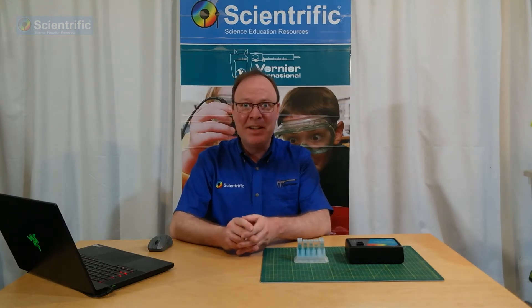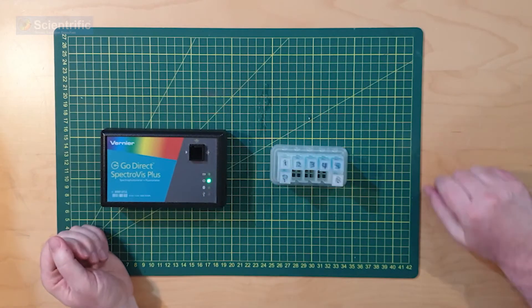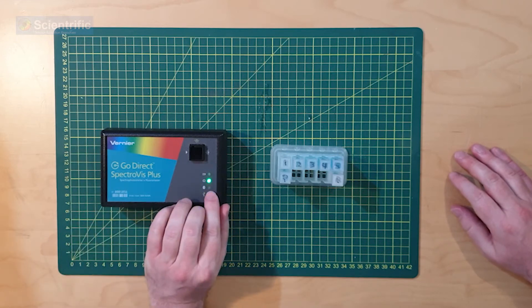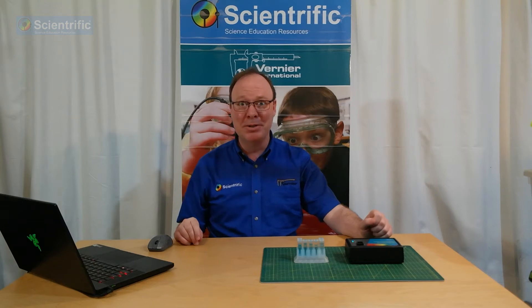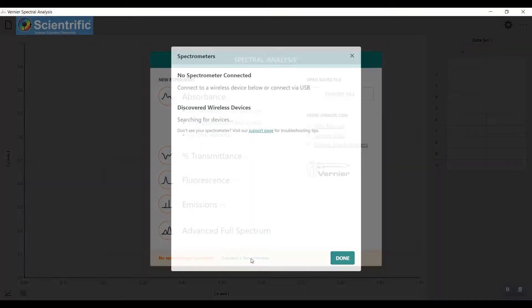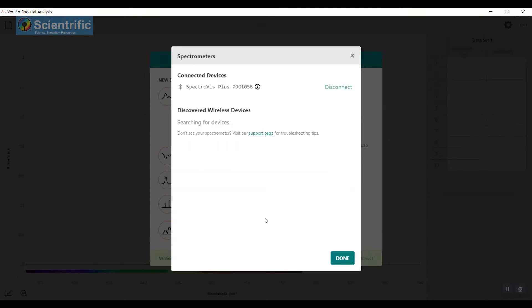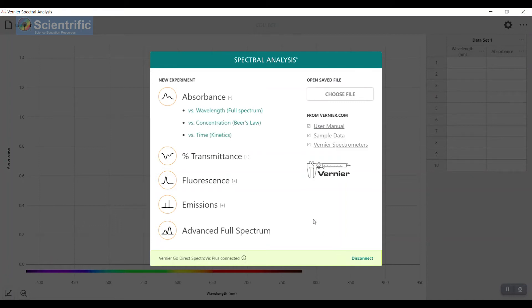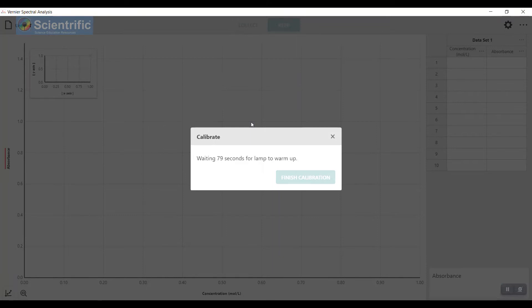We'll put all this together and get rolling. First thing I'm going to do is turn on my spectrophotometer. The blue light indicates that it's sending out a Bluetooth signal, so I'm going to Bluetooth it straight to the computer. Over here on the computer, we have this option for connecting a spectrophotometer. I've found one — I'm going to click Connect. Now that it's found it, I'm going to click Done. We're going to be doing Beer's Law, so I'll hit Beer's Law.